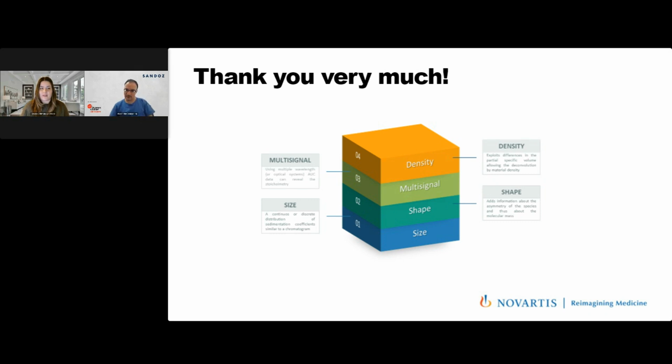Wonderful, thank you. Our next question says, how much better can you characterize partially filled AAVs by MWL AUC compared to measuring at 2 wavelengths, 260 and 280 nanometers? So hydrodynamically, I would say not much better, even a single wavelength, because you have more scans. Maybe if you look at the, let's say, species separation, more preferable. But if you want to know how much nucleic acid is in there, multi-wavelength is, of course, much more preferred.